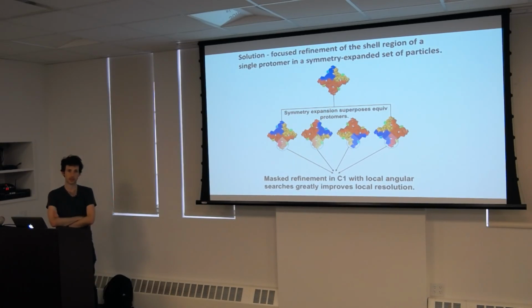It's just that the issue that I have with that is often it seems that all the programs that are out there are basically based on the same algorithm, which is just a box-wise FSC calculation where you calculate multiple 20 voxel by 20 voxel FSCs. They seem to filter much too aggressively in lower resolution regions, and I don't know quite how to deal with that. But yeah, I don't have a good answer for that.